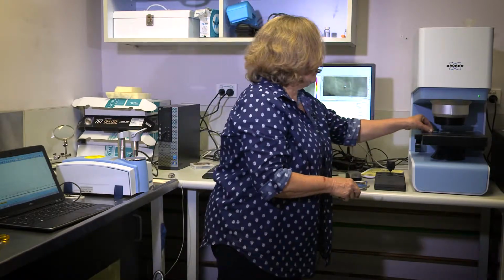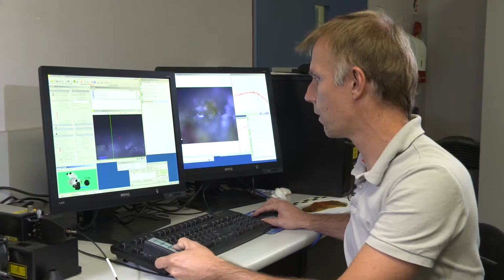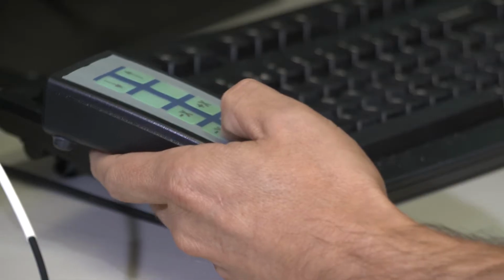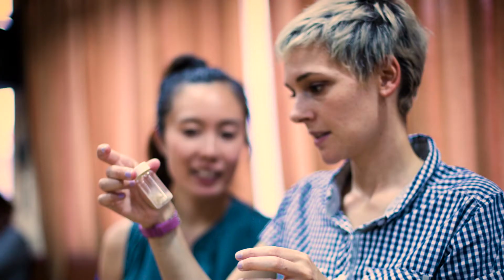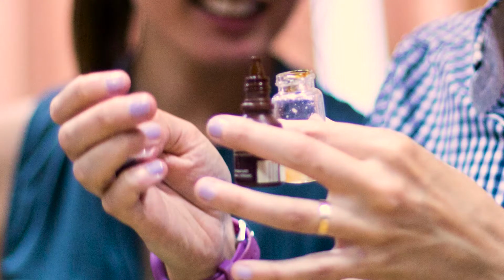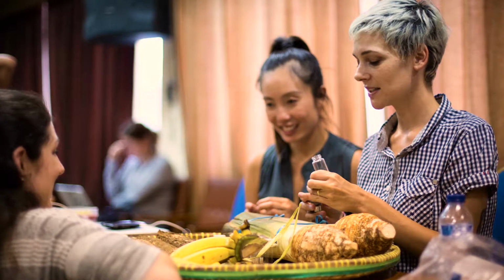And then if there is anything interesting, then it will come to Linda and Luke, who work on spectroscopy, and that's another good analytical technique to use to screen the stone tools and get some sort of molecular information of the composition of the sample. And then my step is the final step. It's a destructive method. We basically isolate the residue, process it so that it makes it amenable to mass spectrometry, and then identify the molecules and separate them in the sample.